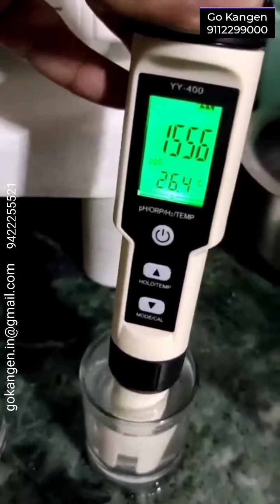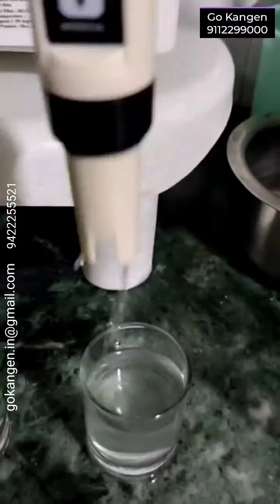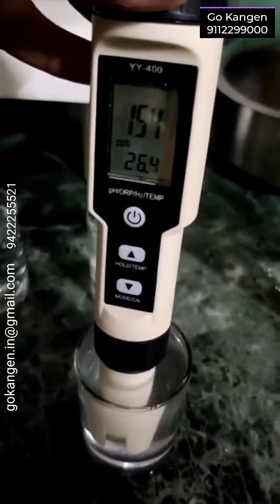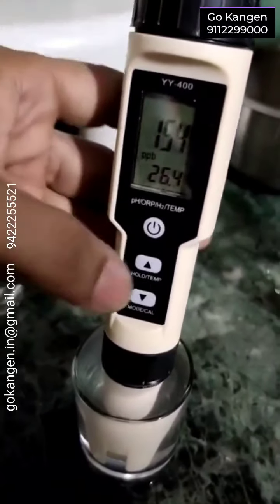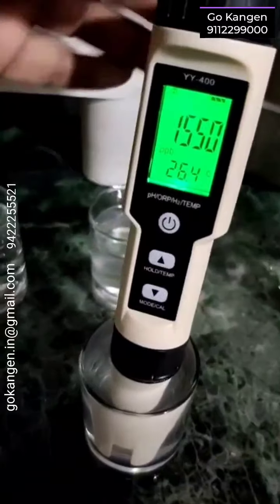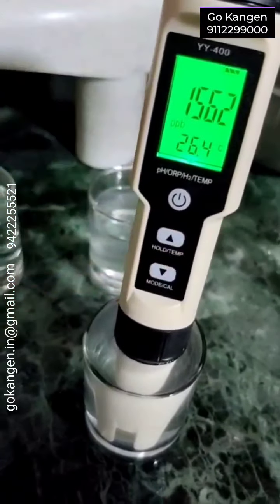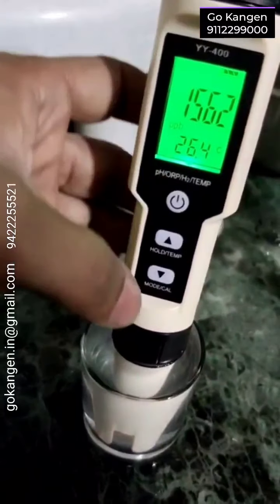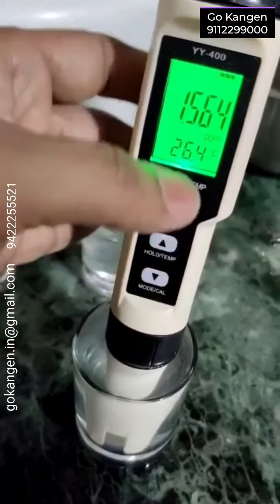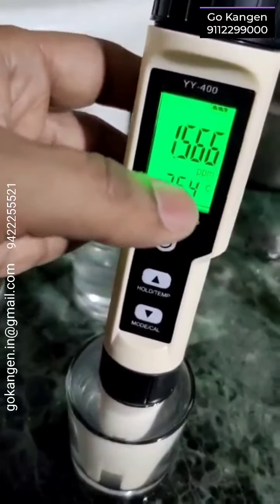Wow, it is showing more — 1500. This is also 11.5, around 1500. Now press this hold button. Again, I am releasing it. And if I change the mode — hydrogen in PPM. So this is 1.5 PPM, parts per million.